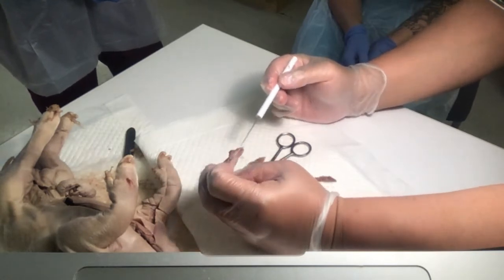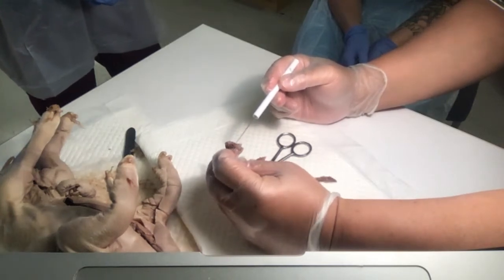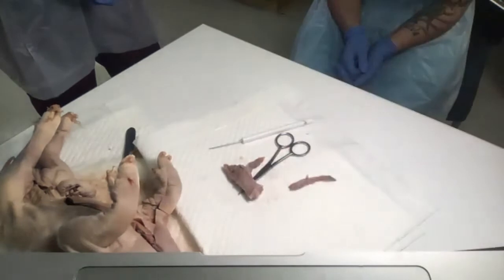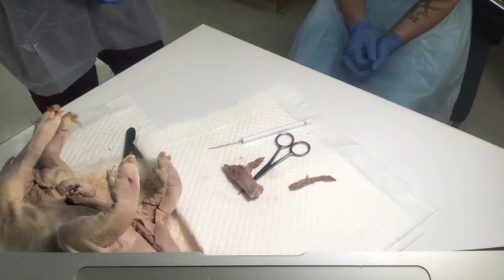So now when I'm eating, does everyone look how soft but expansive, how flexible? And of course, there's an artery, right? And we know that from last week's lab. But this big tube down here, that's got to be your what? Esophagus, your food tube. And the food tube has to be what? Flexible. It can't be rigid.